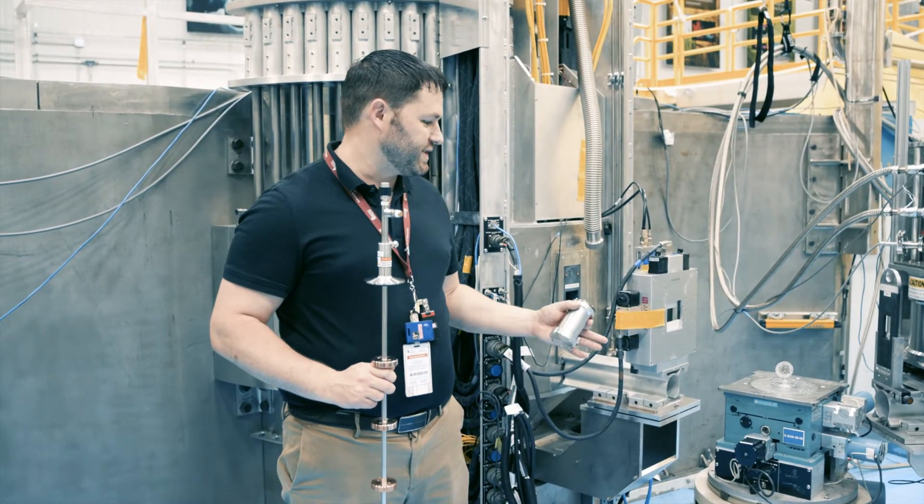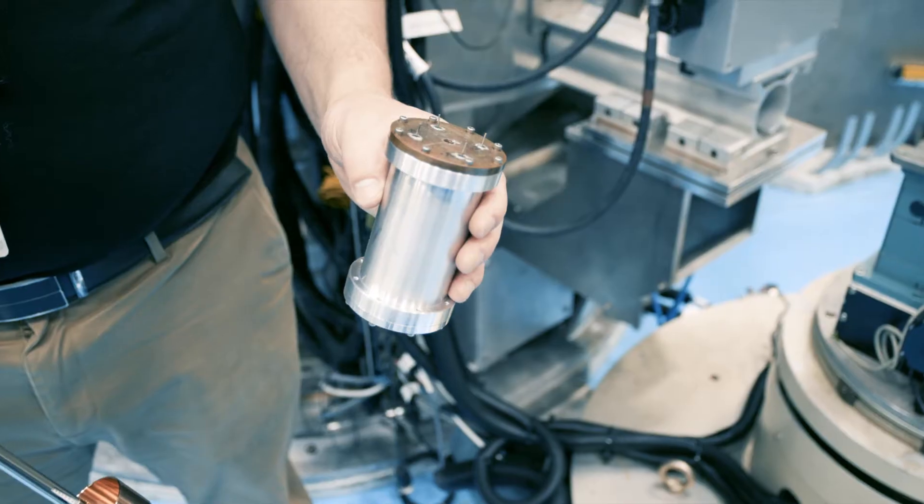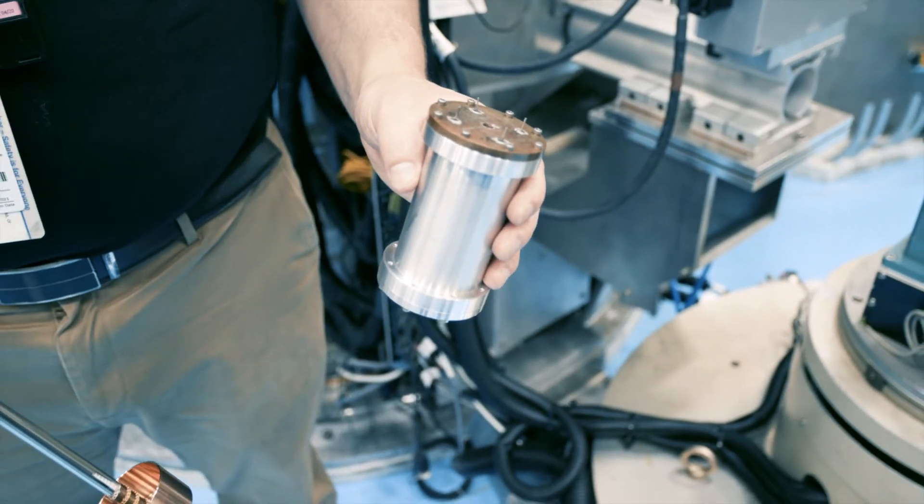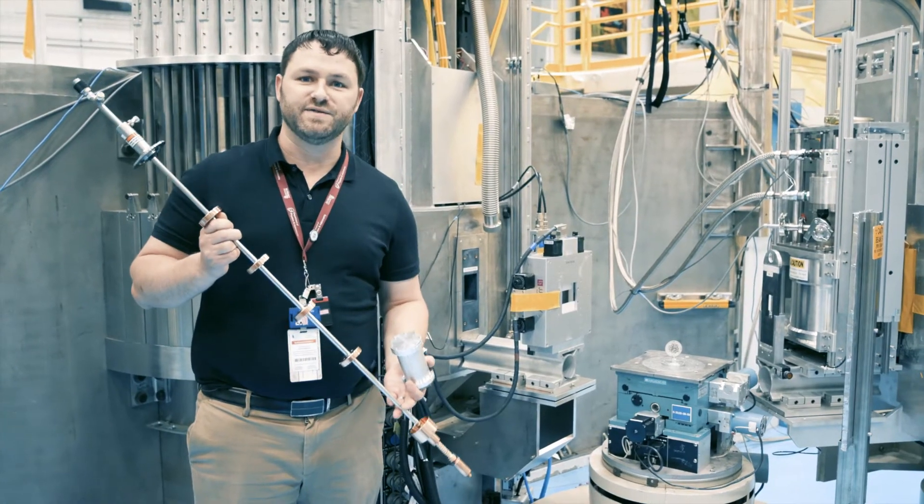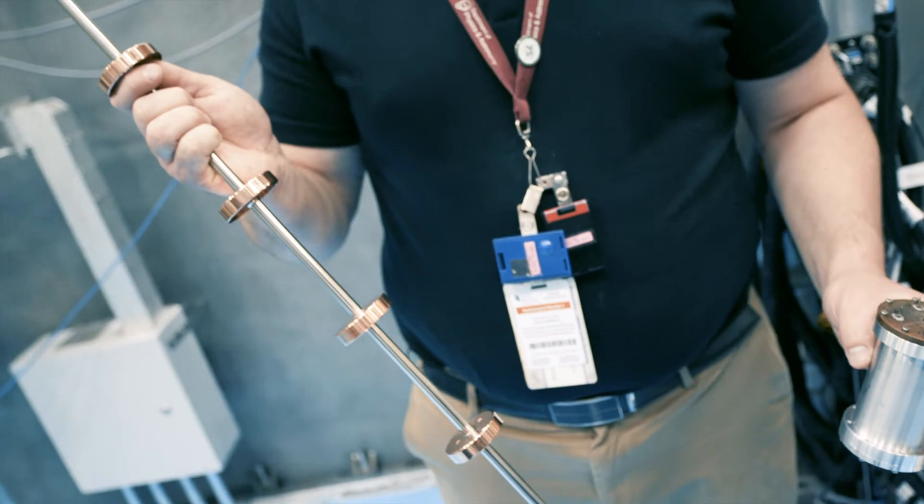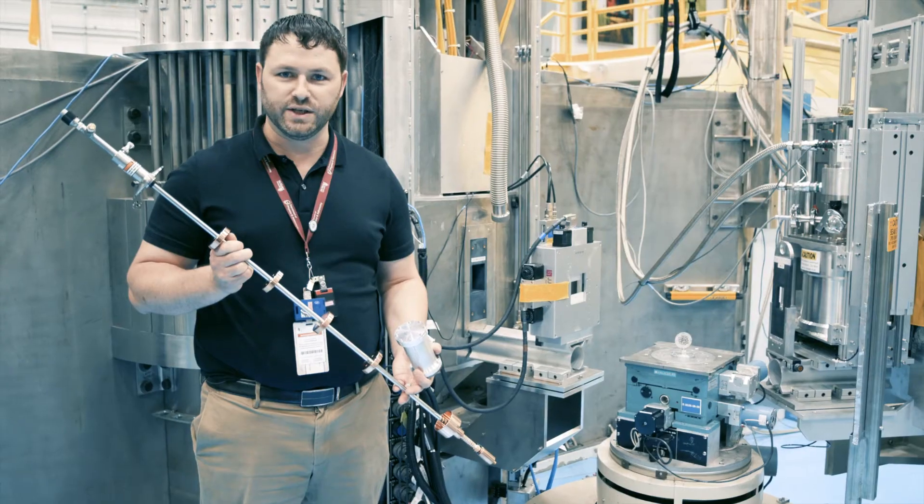So when we're ready to measure our crystals, we'll put them inside cans with specially controlled atmospheres or on the ends of sample sticks that will then get loaded into the cryostats or furnaces that you saw.